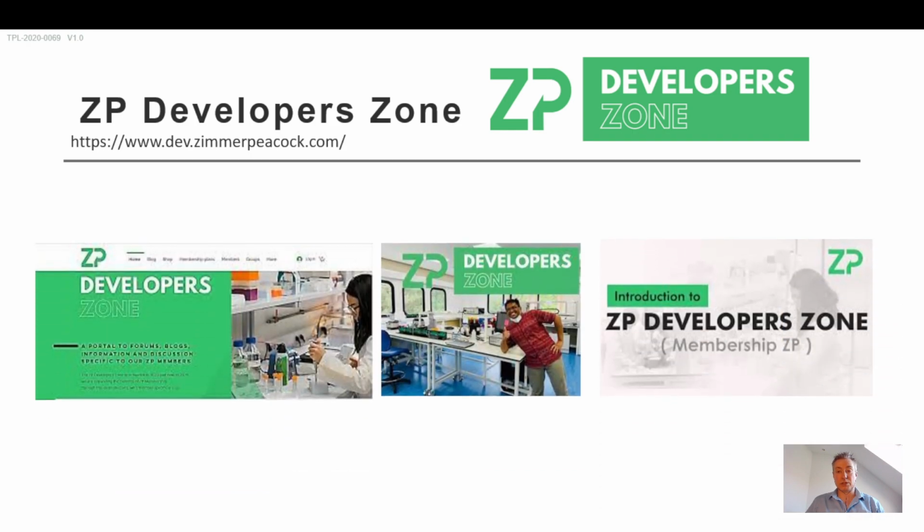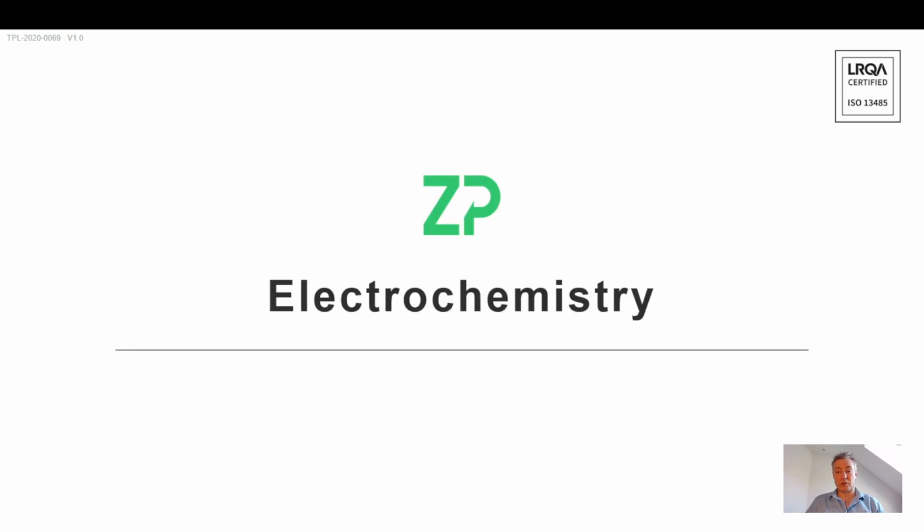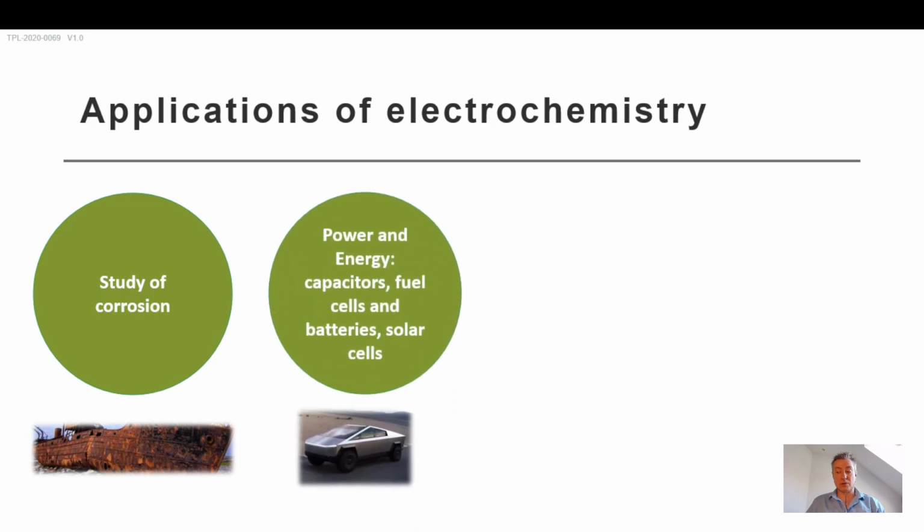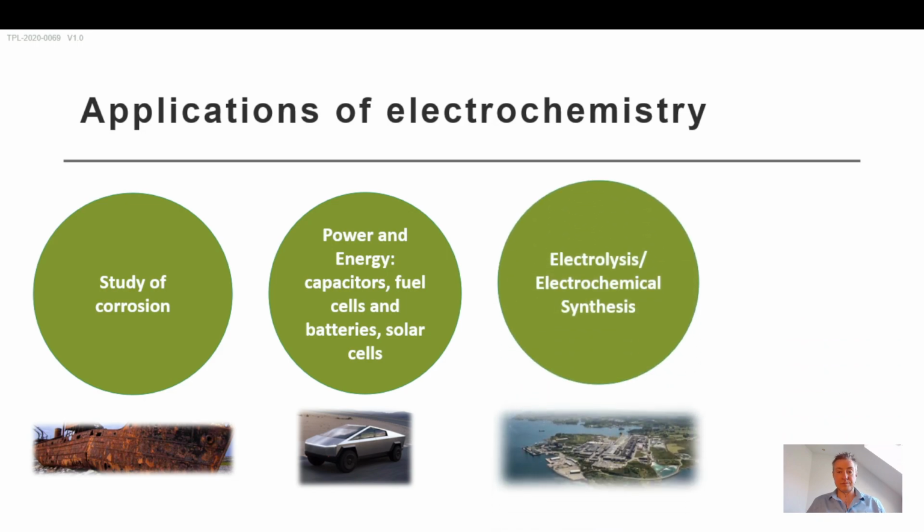So now I'm going to jump into the main part of this presentation. At Zimmer & Peacock and also at Swansea University, where I on occasions lecture, I lecture about electrochemical biosensors. Electrochemical biosensors fall under the overall umbrella of electrochemistry. Electrochemistry is often used in the study of corrosion. Historically it has been the science of batteries, energy and power, and because of the move to electrification and portable power supplies, one of the biggest applications these days is in lithium-ion and lithium polymer battery development.